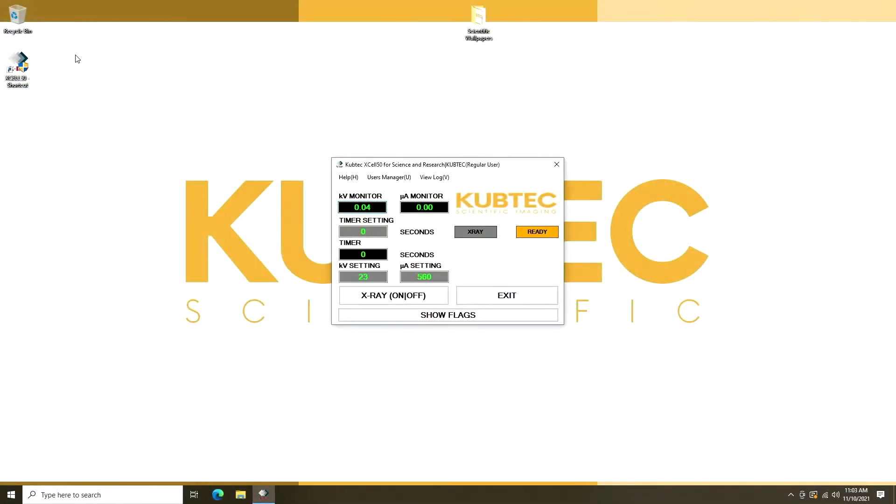Next, you go to the main screen and there are two control options: Voltage, which is defined as KVP, and Current. To irradiate the sample, input your desired values, then click the x-ray control on.